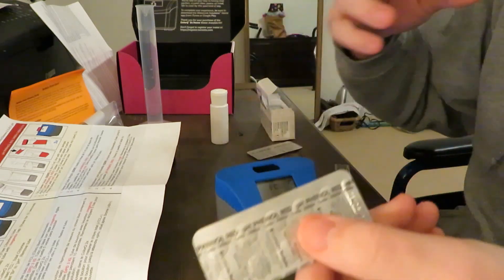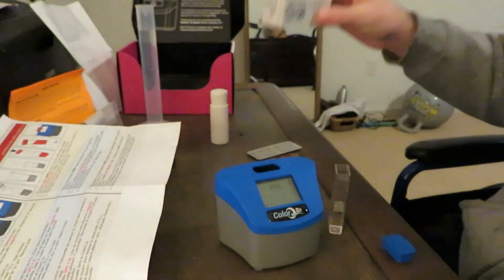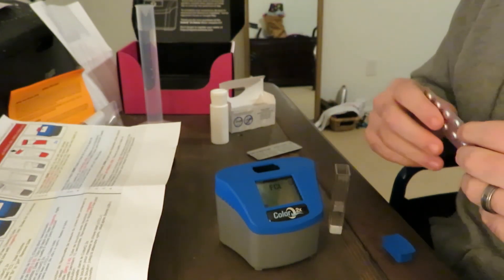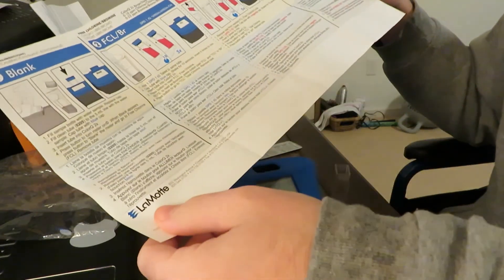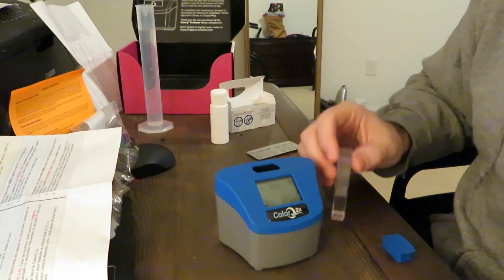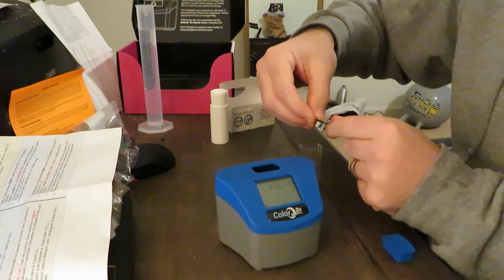They're easy to identify because on the back of them it's labeled. This is phenol red for pH. The calcium hardness — it says it right on there. You get 20 tests for each chemical level you're testing. The directions are really easy. It comes with this really awesome handout that has every single direction for each one. It seems very simple — it tells you to just fill it to the 5-milliliter mark and simply pop in one of the reagents.